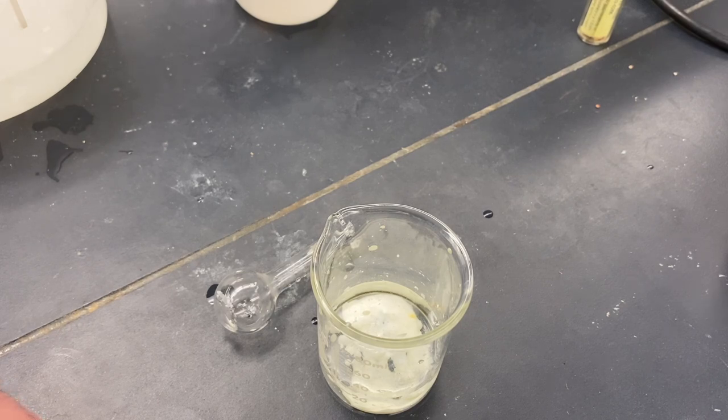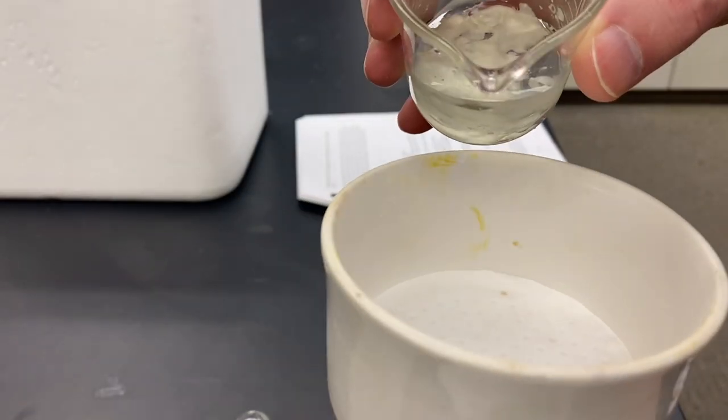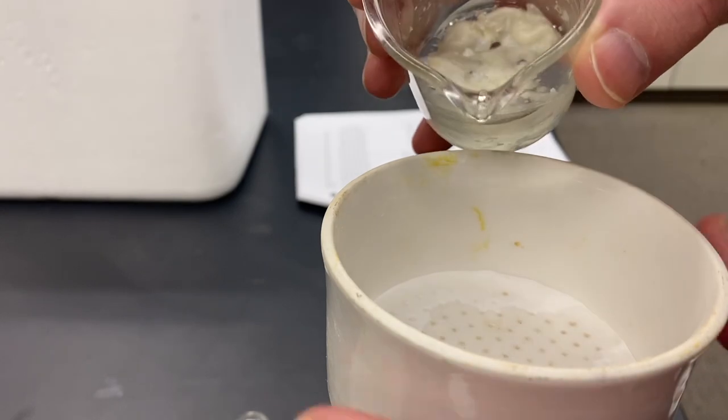So that second purification step will take the place of trying to weigh the crude product. So we're just going to get this added into the Buchner funnel.